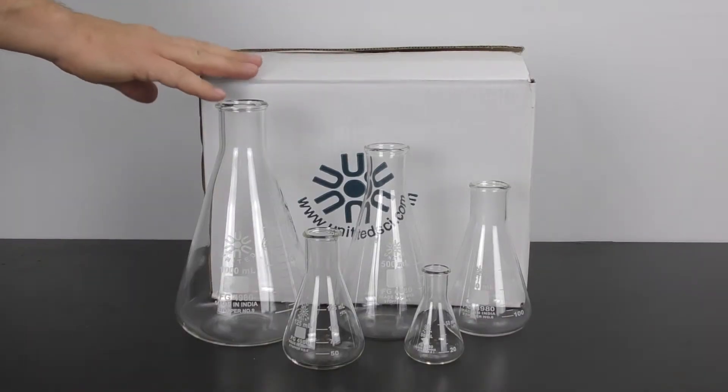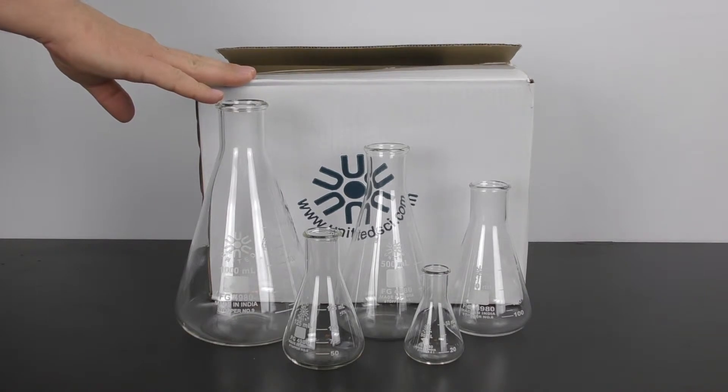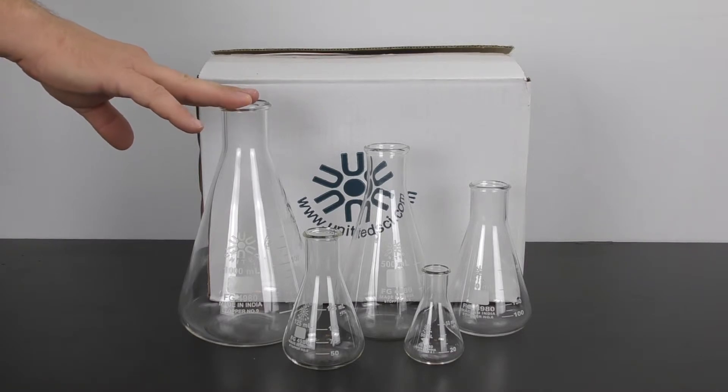These are all packed to save as much space as possible, so you can order quite a few of them without taking up a lot of room, and each one is packed very diligently to ensure that it arrives to you safely.